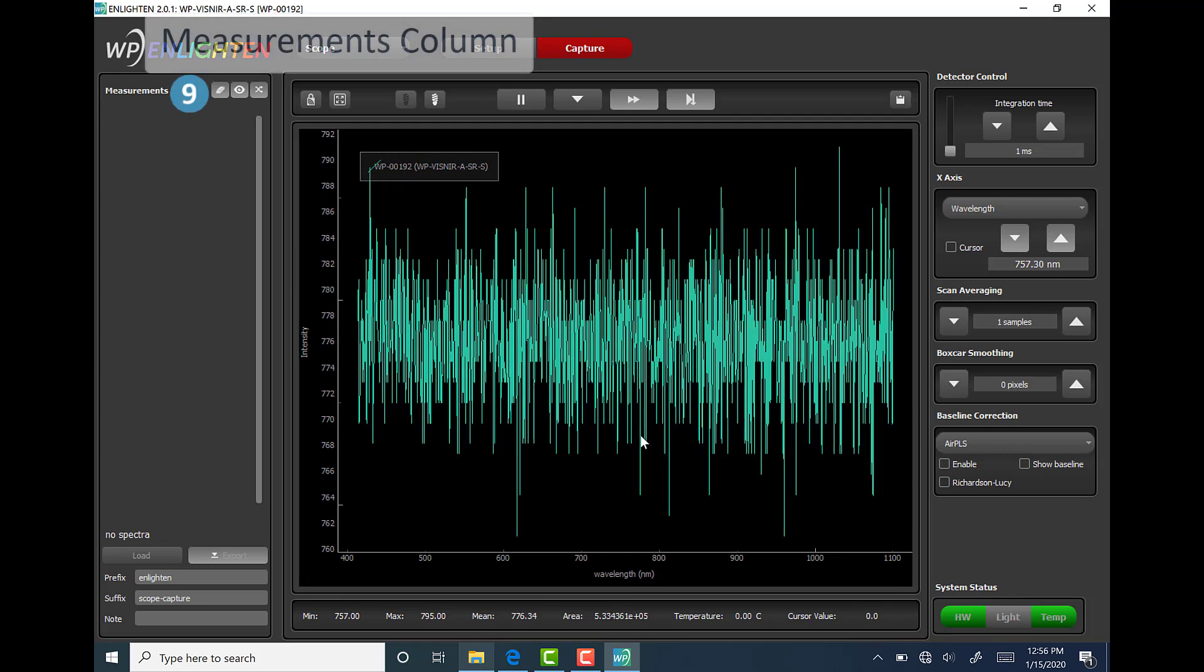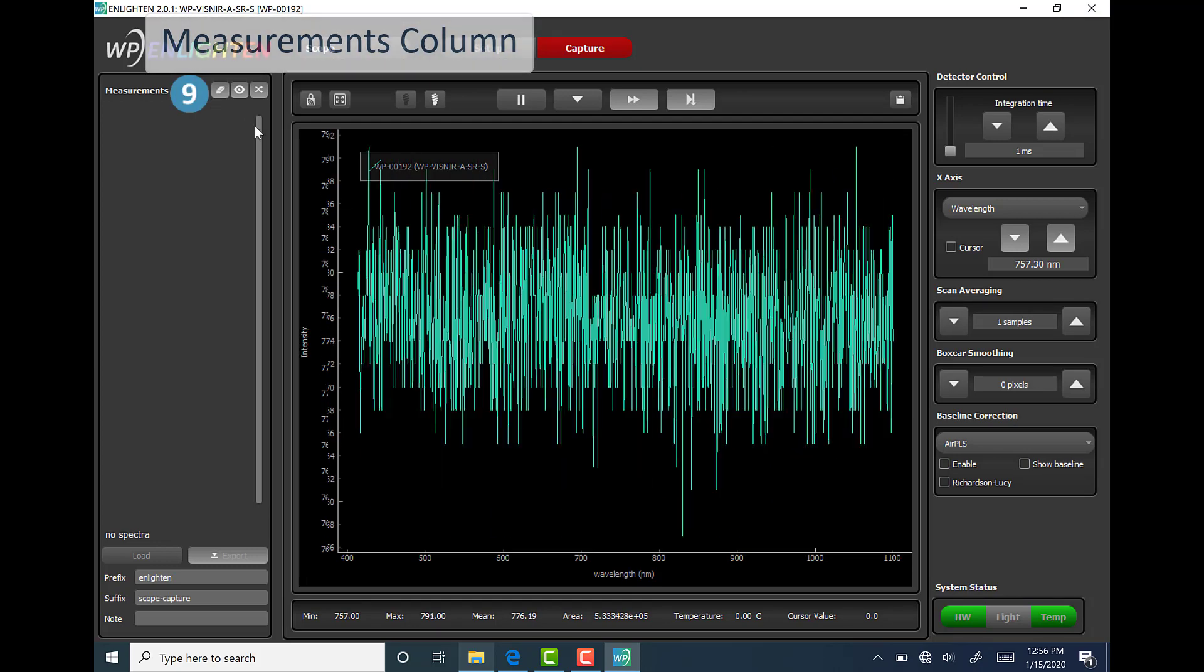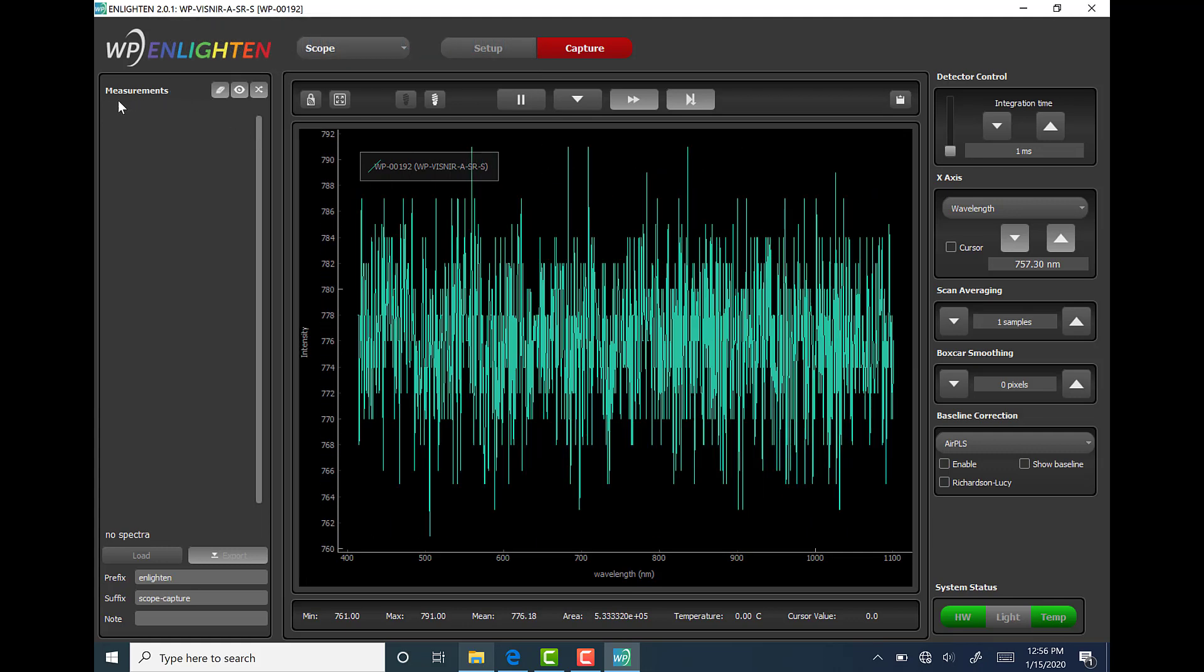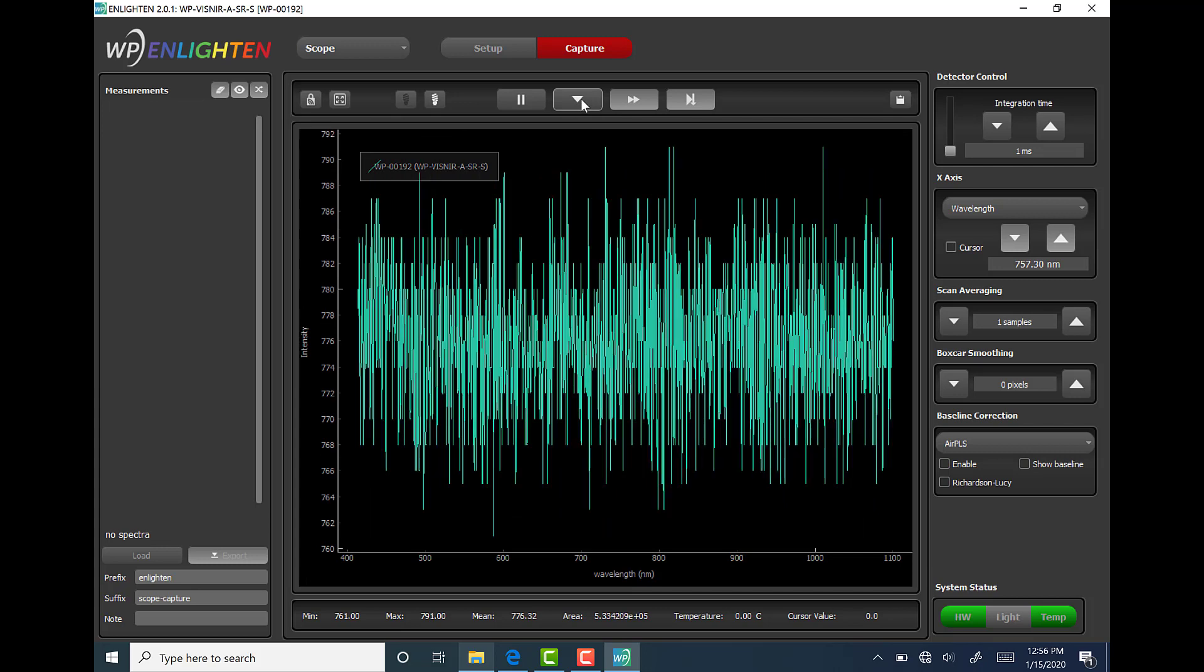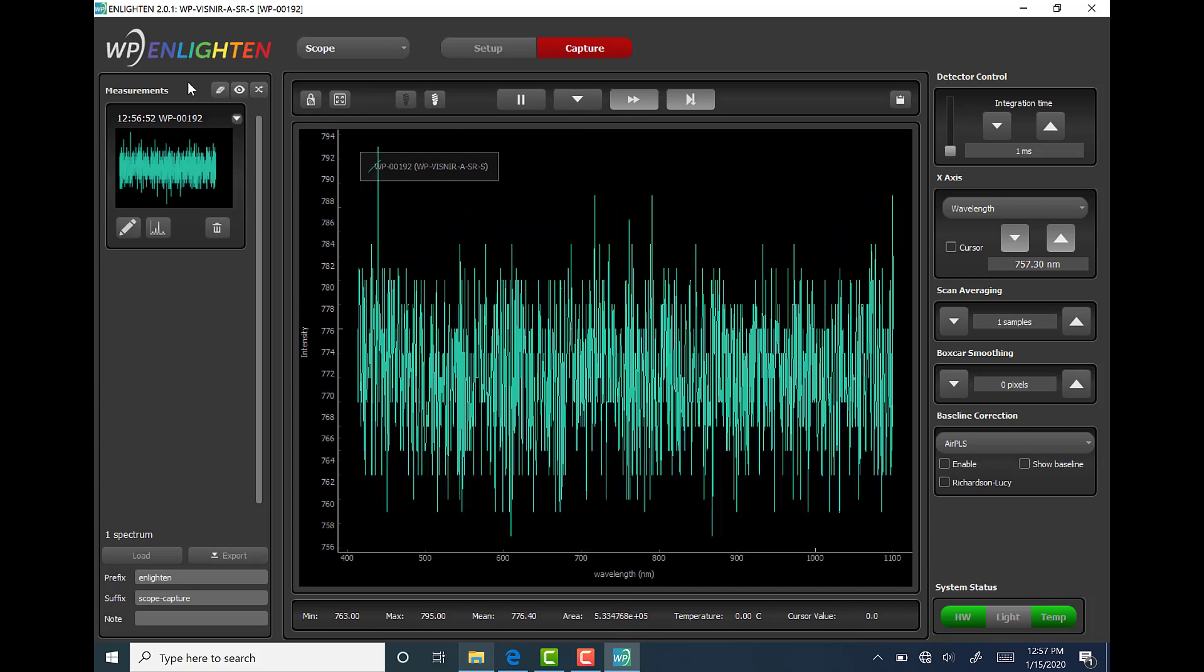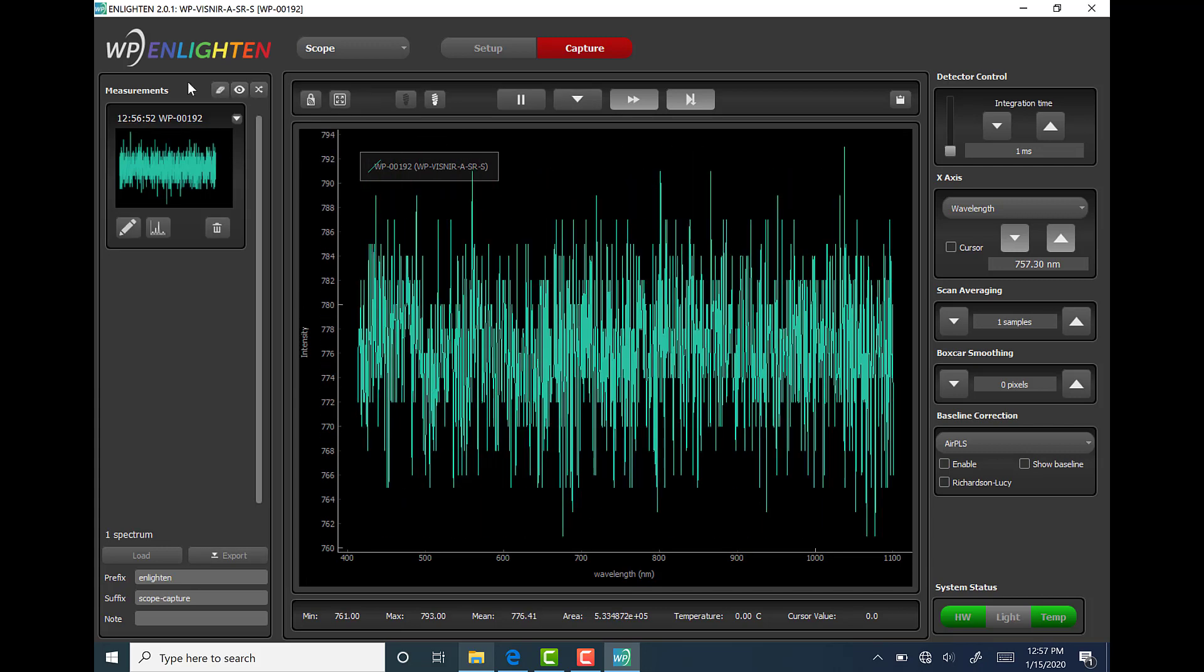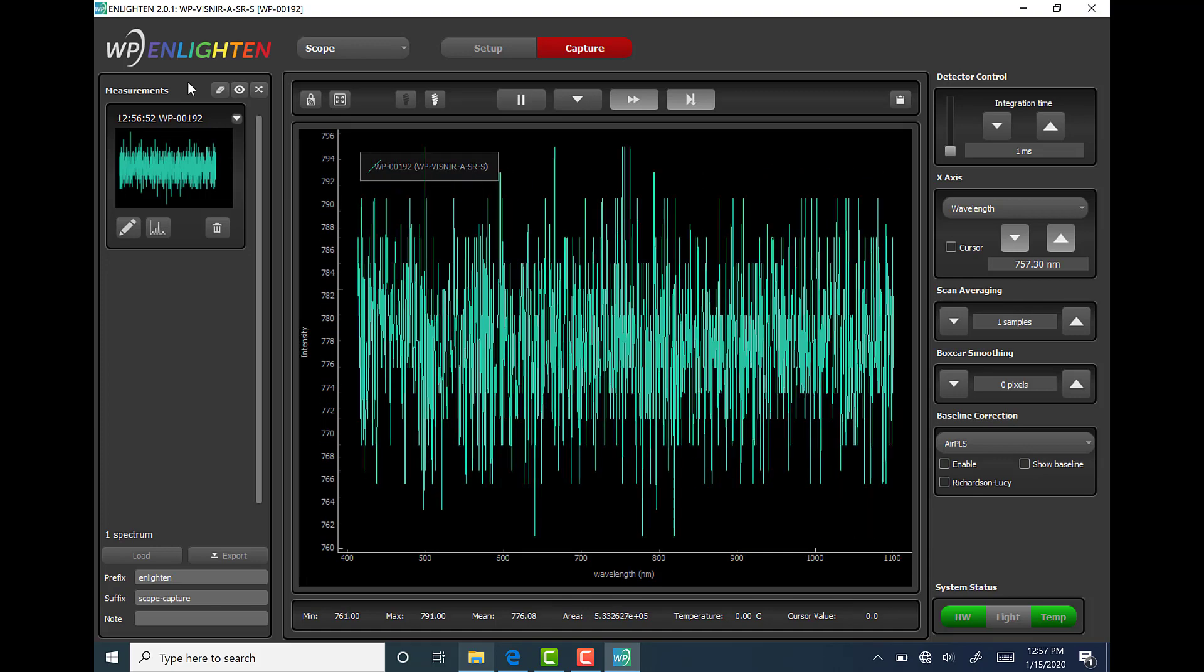Next is the measurements column which can be found on the left hand side of the software window. This column keeps track of the measurements that have been saved during acquisition. It fills with graphical thumbnails of each measurement. There are several features that will be discussed in further detail in future videos.